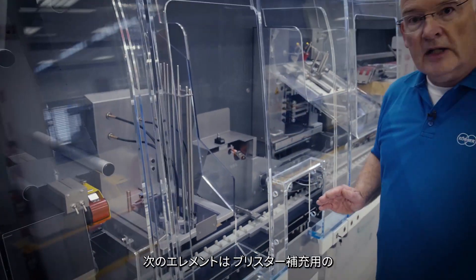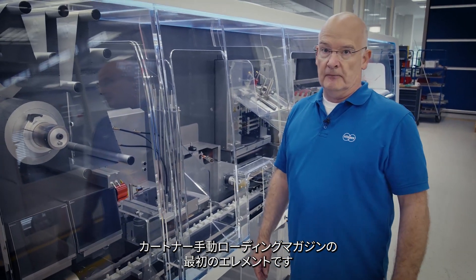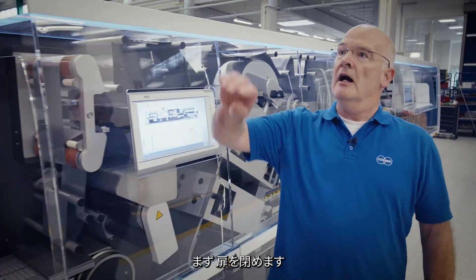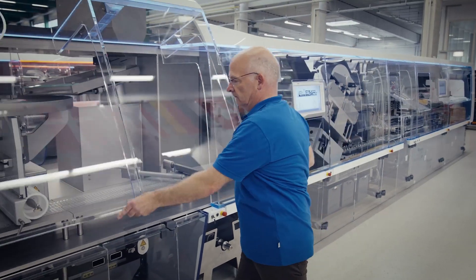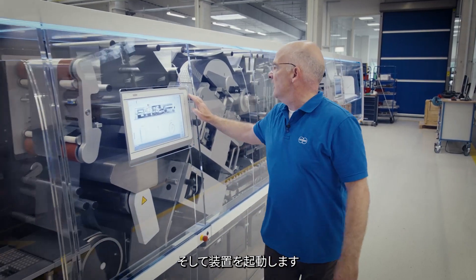The next element is already the first element of a carton: a hand-loading magazine for blister replenishing. Let's start the machine and see some moves of the cycle speed. I have to close the doors first and then start the machine for you.